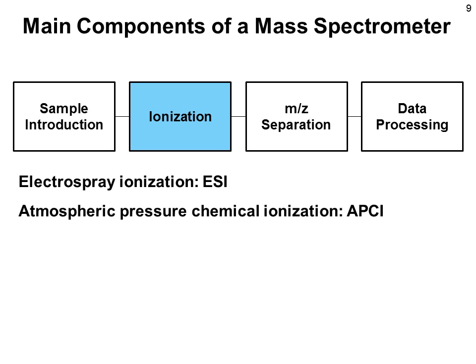Atmospheric pressure chemical ionization is a more harsh method, especially used for molecules that do not have ionizable groups. It's abbreviated APCI. In this case, a plasma is generated in which ions are formed even of molecules that do not ionize easily. As you may imagine, if you have a discharged plasma, biological molecules are likely not to survive this process.